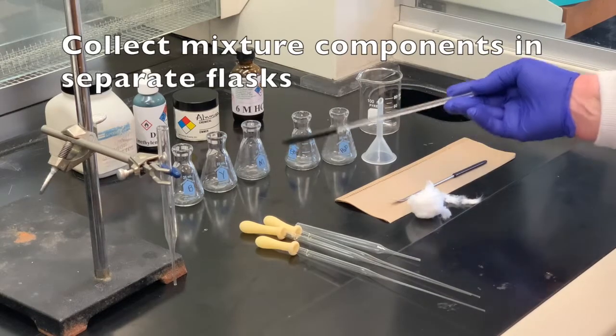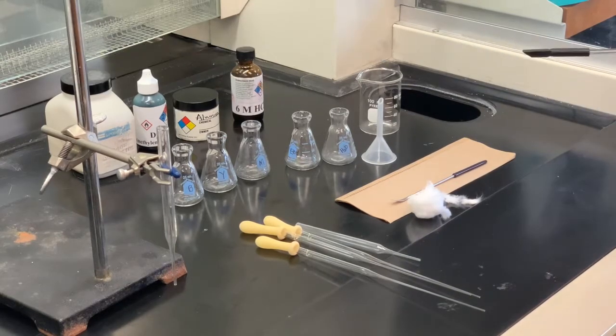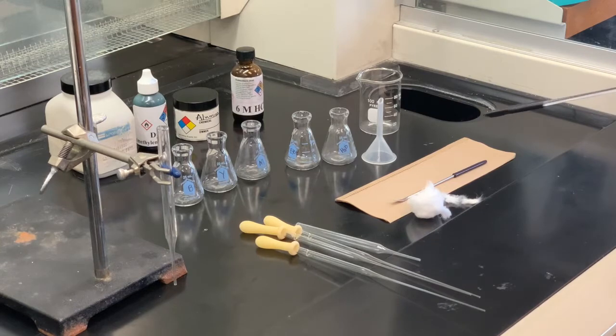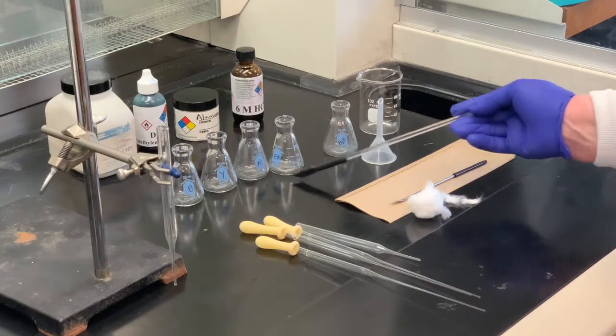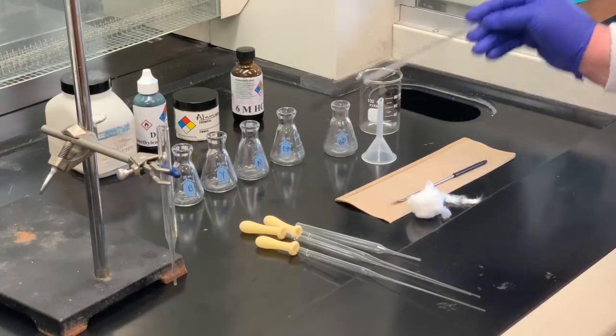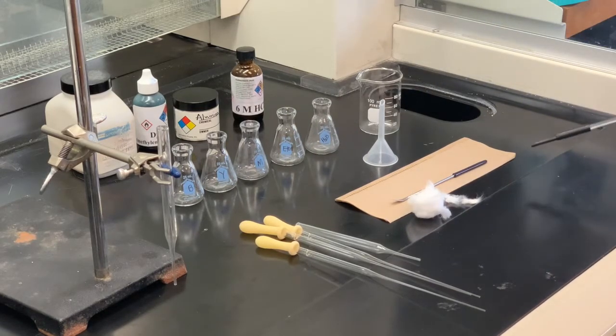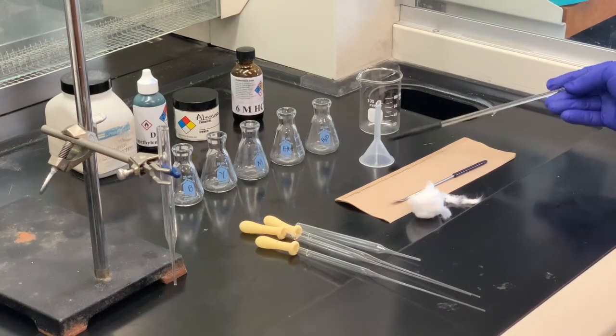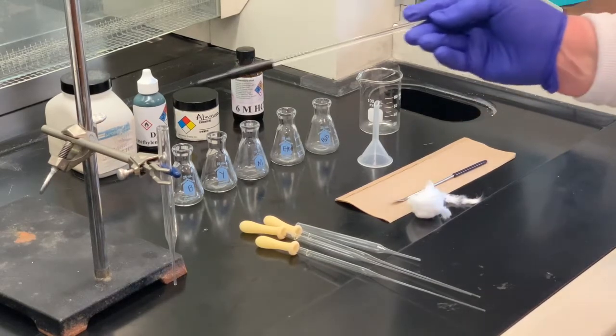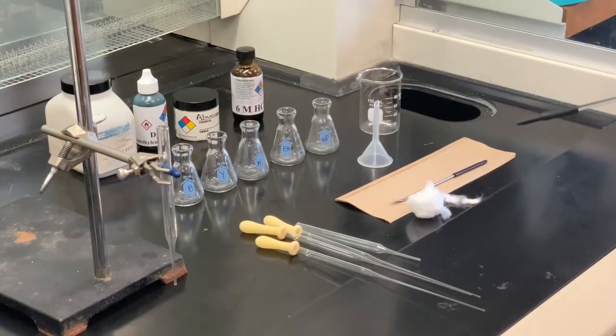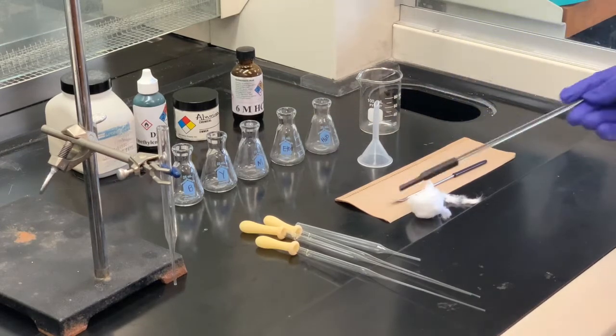We're going to collect our dyes that are in the mixture in these separate flasks. I have one flask that's called a mixture. You'll understand what I mean by that as the experiment goes on. And then I have one that's labeled for ethanol. That's one of our solvents that we're going to use. And then we're also going to use water as another solvent.